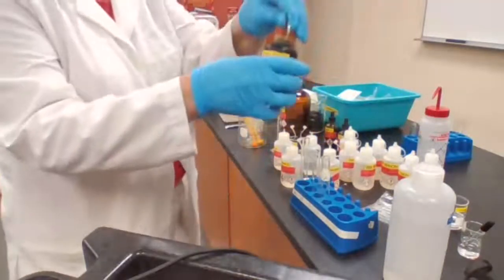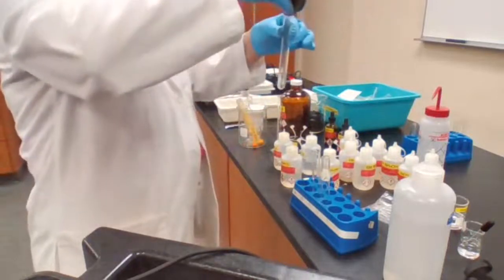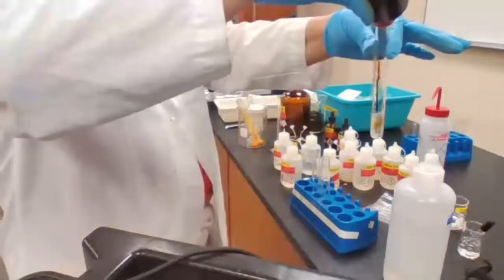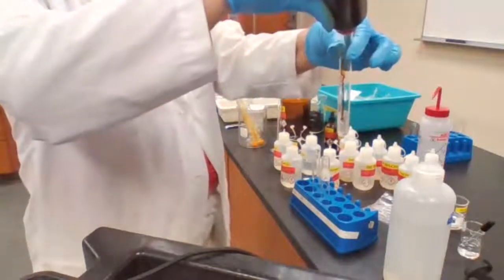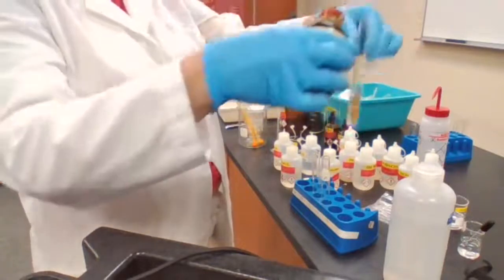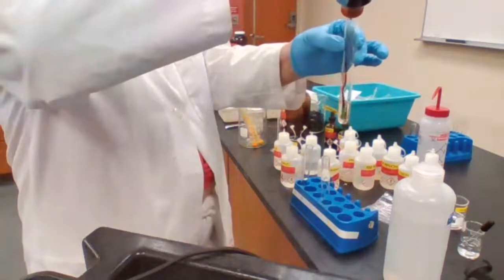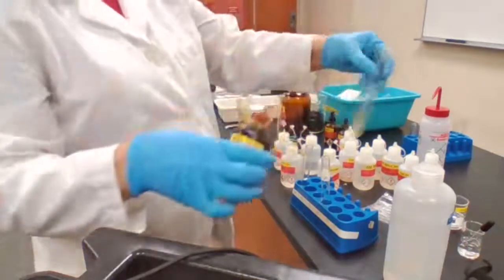With the iodine solution, 10 drops, and look for a yellow color precipitate. If a yellow color precipitate appears, I'm going to stop, but either the color has to stay yellow or a yellow precipitate should form. And only one of these three is going to form the yellow color precipitate. So I'm going to add the 10 drops. Mix it well.